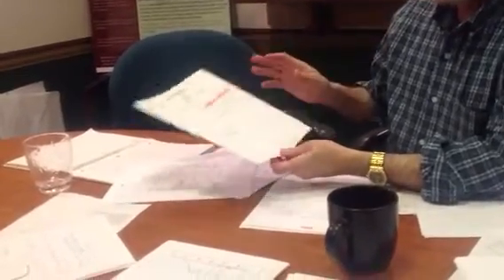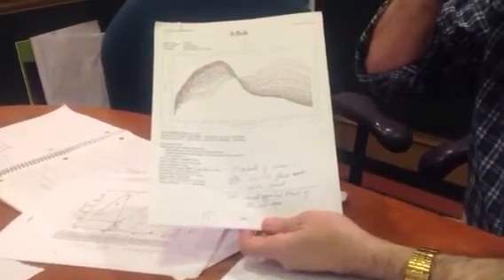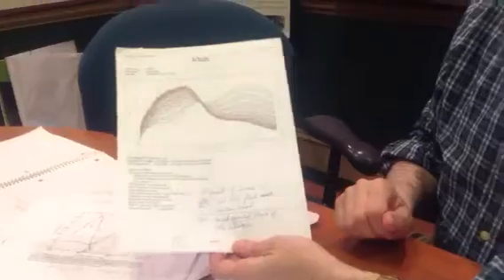So then on the second visit, we said, well, what about if we use living cells? Can it work? And we obtained a similar kind of result. These are the cells, and these are individual scans from the rapid scanning monochromator in the Clarity 1000, in the dispersion cell.